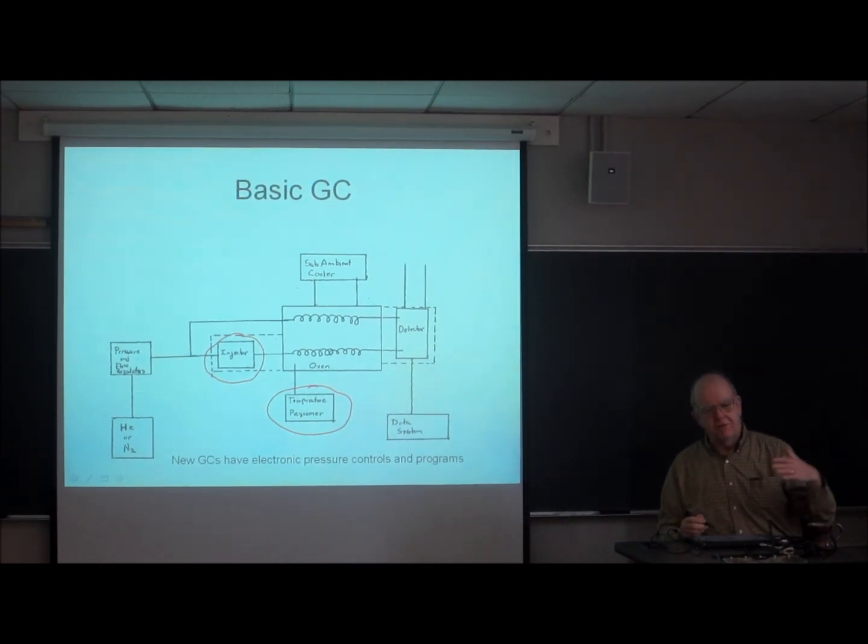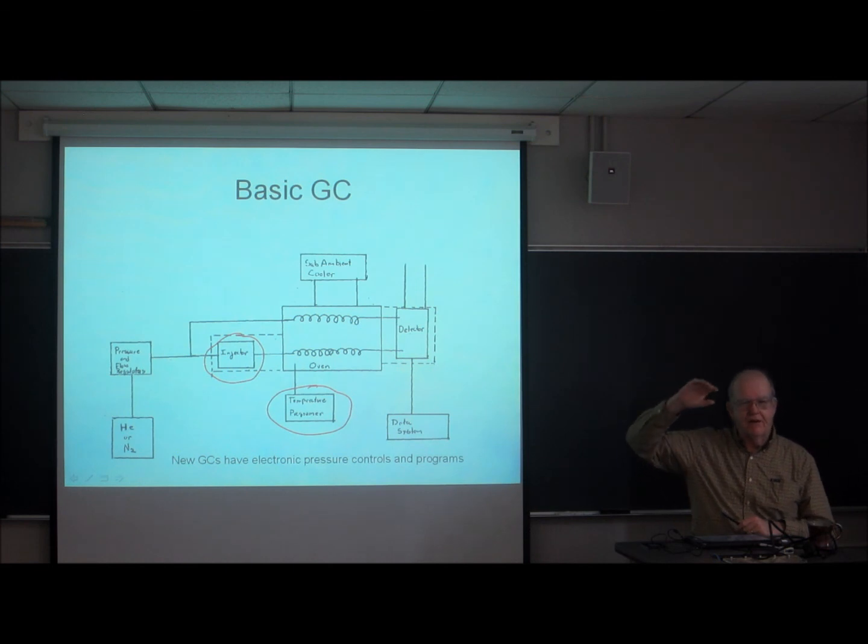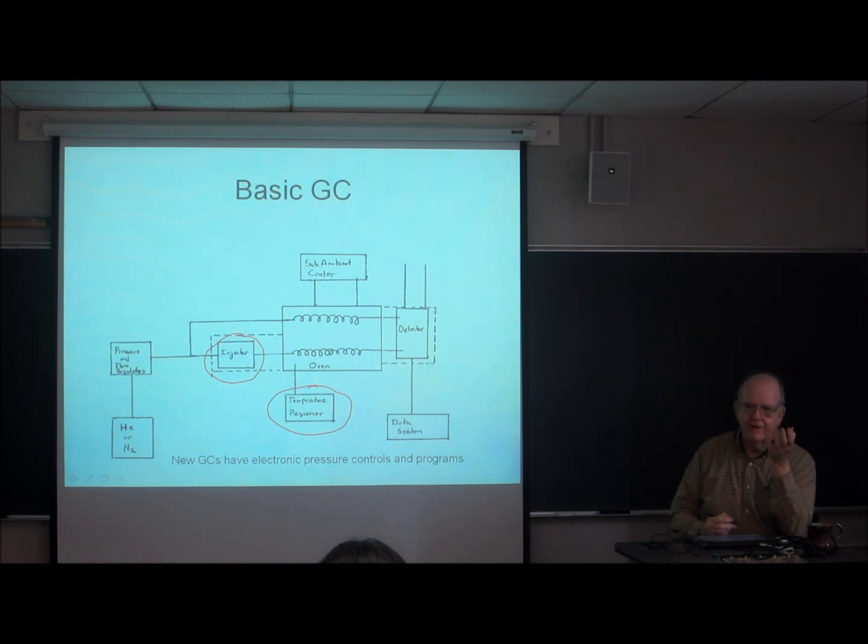Moving the sample through the system, through the injector, over to the oven, over to the columns, and out to the detector is carrier gas. And that is very simply supplied by a tank, a pressurized tank of that gas. The most common gases are helium and nitrogen. And until 5 years ago, that would have been absolutely unequivocal.